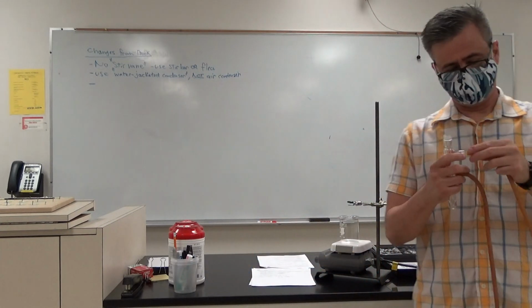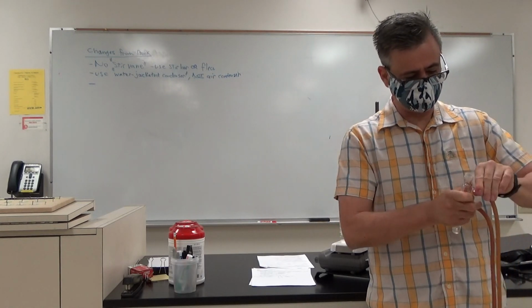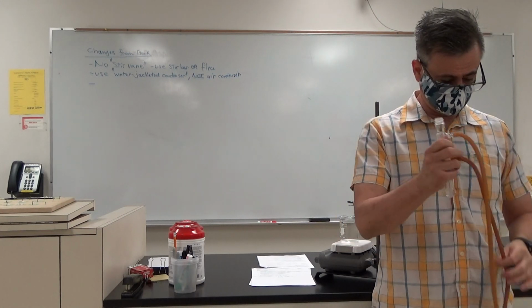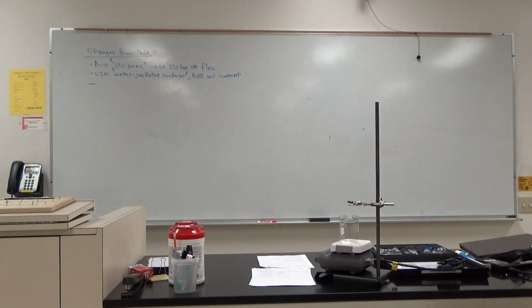And then we need one at the top. Right. Okay. You can also twist. That helps a little bit, but don't use muscle. Okay. All right. So what's going to happen now is it's going to... Oh, I don't have the right type.